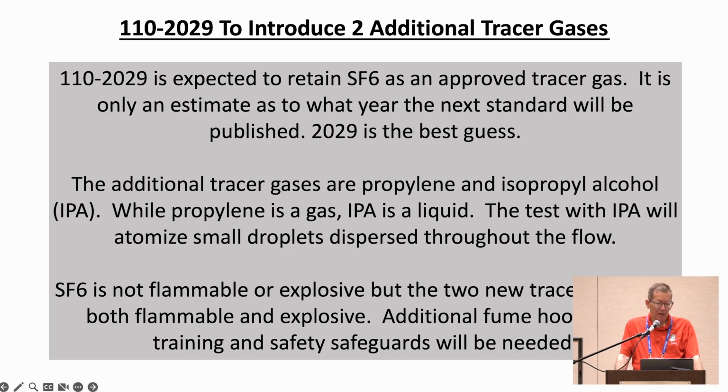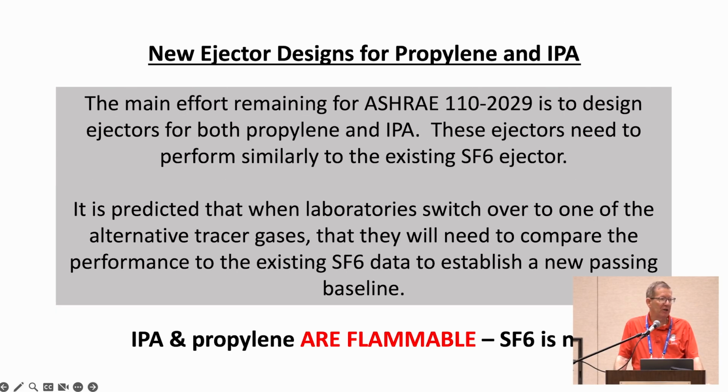So the big problem is that unlike SF6, both of these are flammable, explosive gases. So I don't really like fume hood testers, but I don't want them to be killed in an explosion at their fume hood. So this is going to take some careful training and operation to try to make this a safe test.